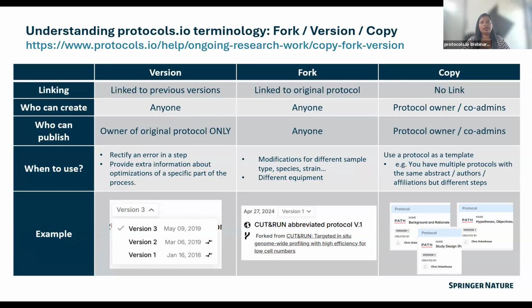Who can create it? Anyone. Anyone can use any protocol and fork that. They can use that protocol as a template and make their own changes according to their requirements. And who can publish? Anyone. So there are modifications for the different sample types.